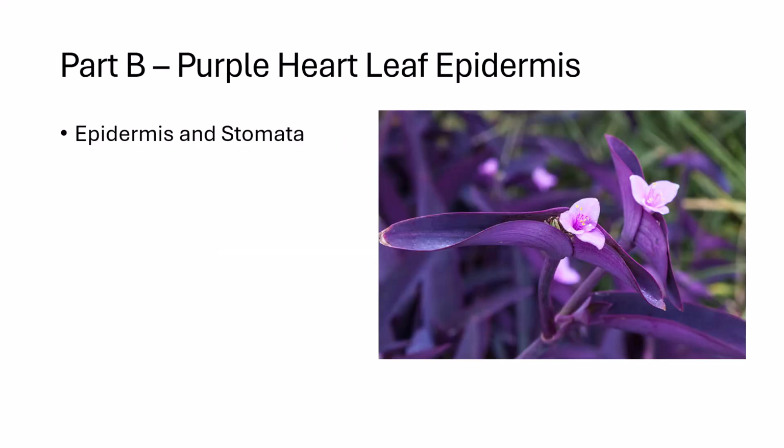To get a view of the epidermis and stomata, we will go back to the purple heart plant. Although instead of looking at the stem like we did for viewing rhaphides, we will peel off the lower epidermis.